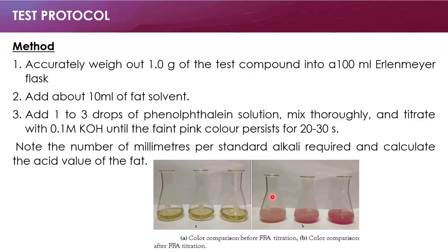From the picture below here, we can see that this happens to be the color comparison before the free fatty acid titration as seen over here, and this happens to be the color comparison after free fatty acid titration. And what we also have to note is that the number of milliliters of standard alkaline required is recorded, and calculate the acid value of the fat.